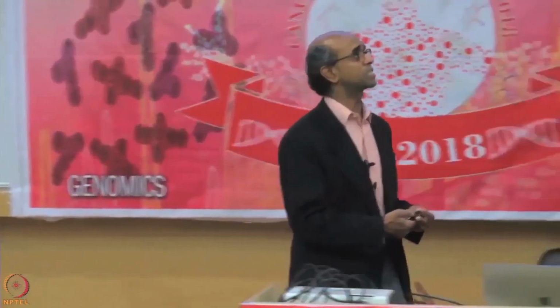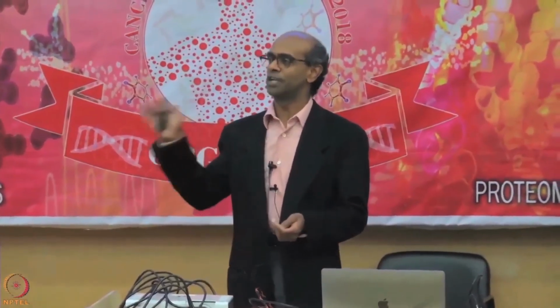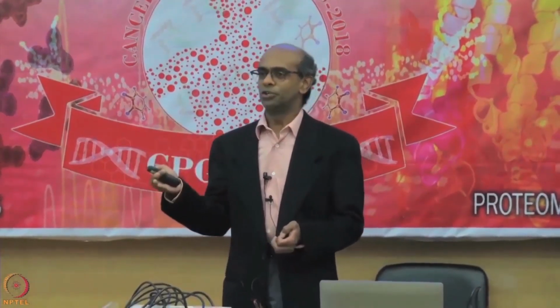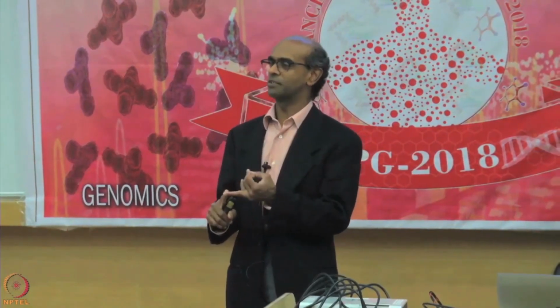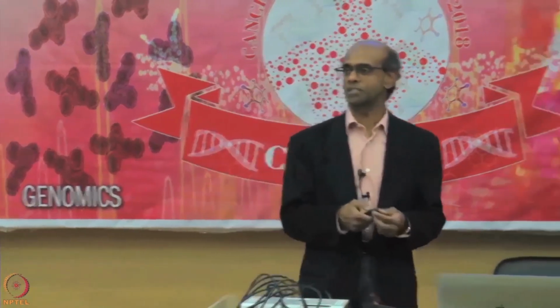So, this is a process that you have to do carefully and be thoughtful about what you are doing and how it affects the questions you are going to ask about the experiment. There is usually no one procedure that works all the time. You have to carefully look at what your experiment is, what questions you want answered from the experiment, and then make sure that the normalization process is appropriate for that.